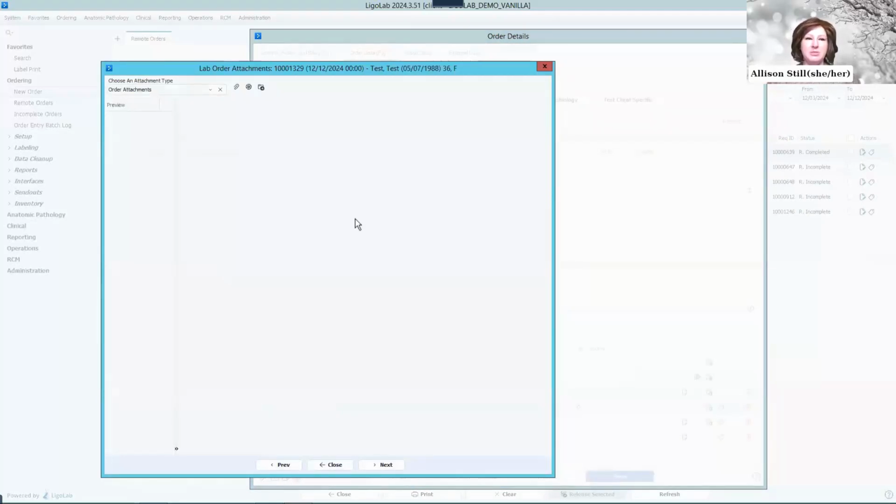For anatomic pathology, we do recommend this one-piece flow where the users can scan in the paperwork, any documentation, billing, anything that's received with the case. So it'll immediately be attached to the case. We do recommend this because the first step this is going to go to in the lab is grossing, where we've built an interface for the grossers that shows these attachments side by side. With this workflow, the paperwork doesn't need to physically follow the specimen to the lab, where it could get damaged or soiled with chemicals in the laboratory.